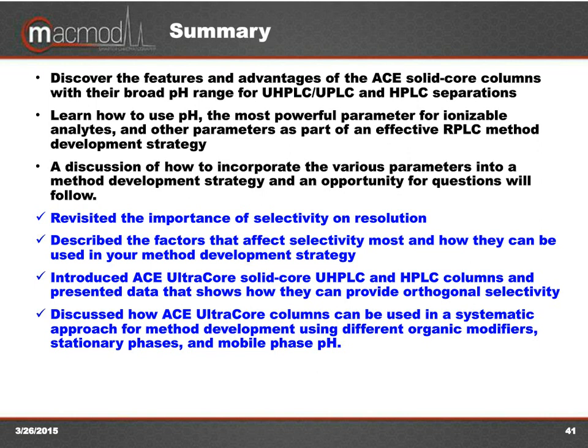And we also talked about and discussed some method development strategies for simple samples as well as for very challenging samples, how you can use the combination of various organic modifiers, stationary phases, and mobile phase pH changes to affect even very difficult separations with 10, 20 or more analytes.